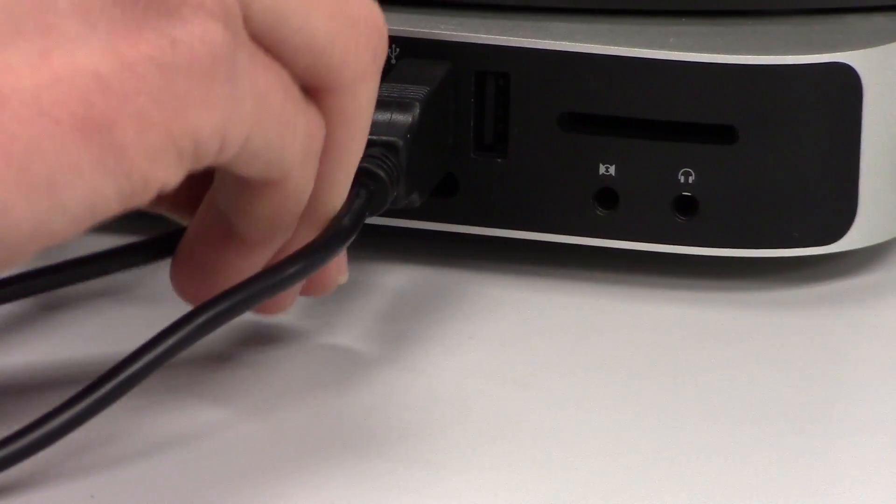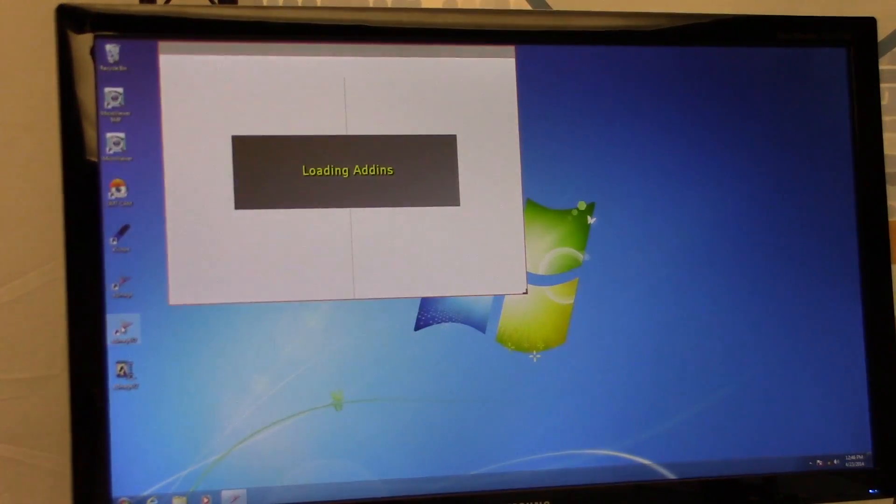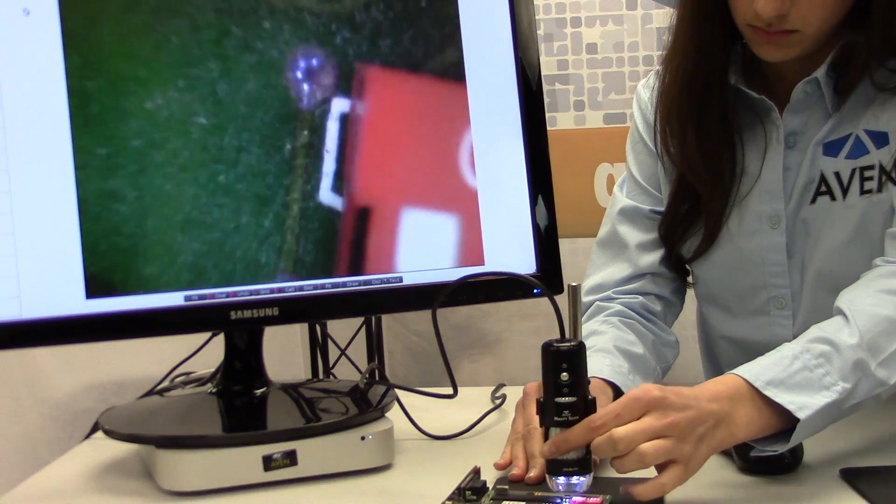To use, simply plug the unit into the USB port and open the software that comes with the scope. The magnification works by focal distance, so the closer the scope is to the object being viewed, the higher the magnification. Once you are at your desired magnification, simply adjust the fine focus until your image is clear on the monitor.